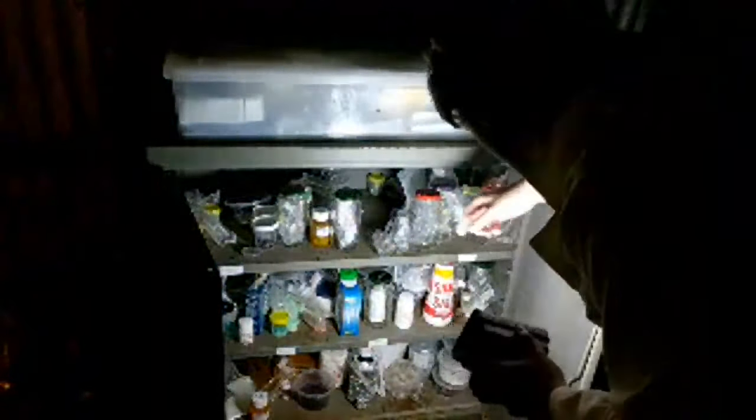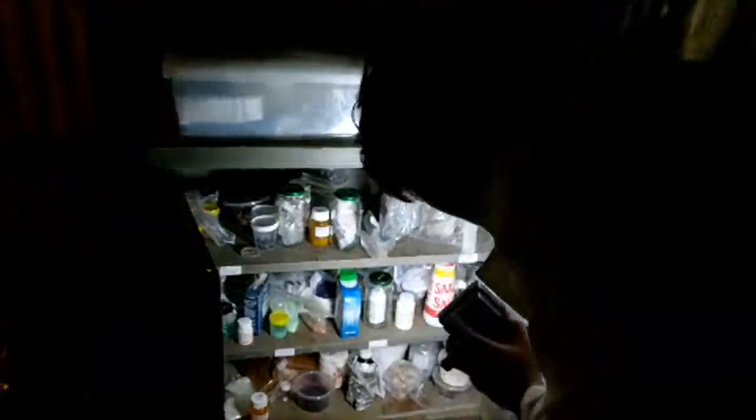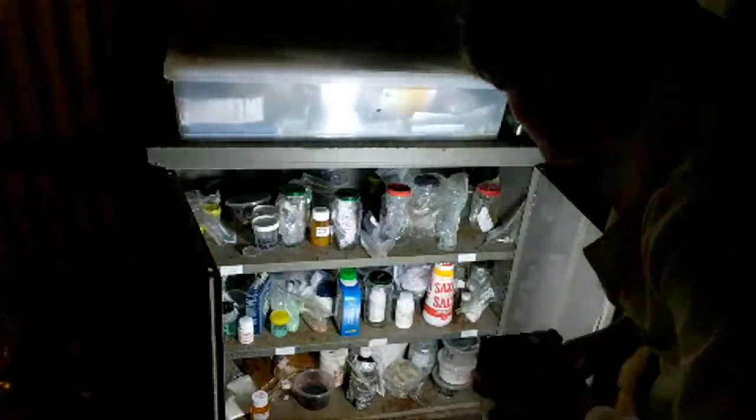I mean, most of you would have guessed by now, but that's potassium metal, and yellow means it's forming superoxides. The sodium seems okay, not the greatest, but that's okay. But God, that potassium, that's so yellow. Oh, that's a hazard. That is a hazard.